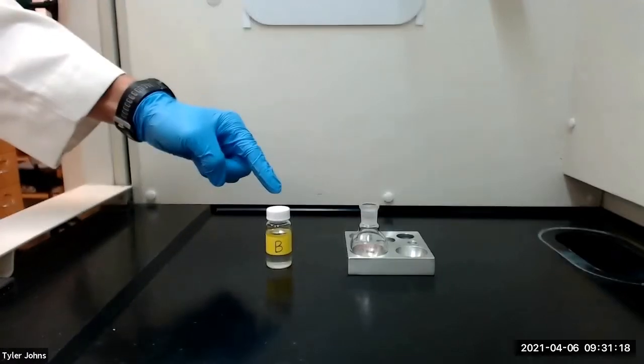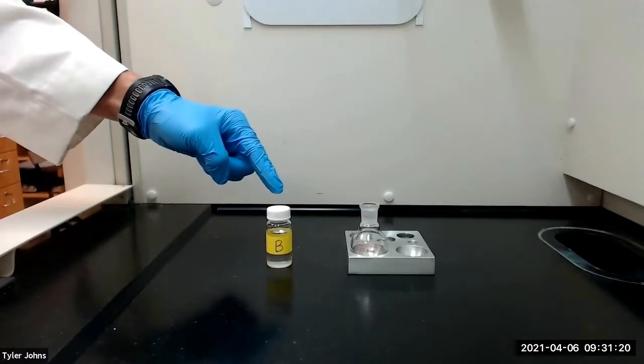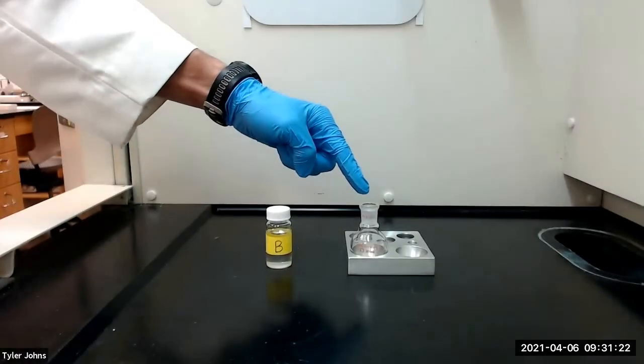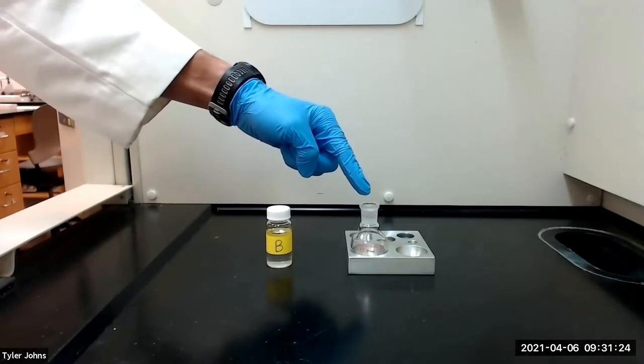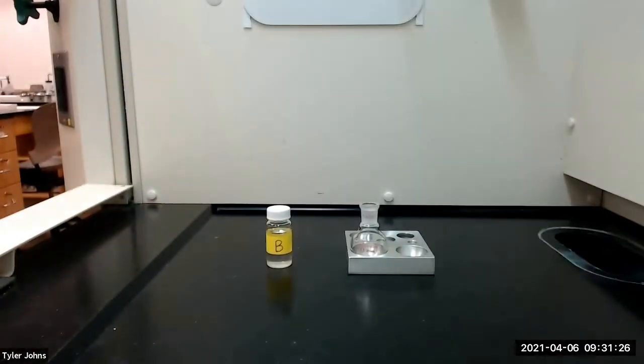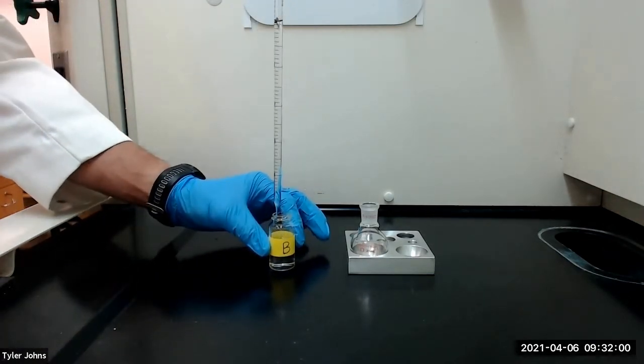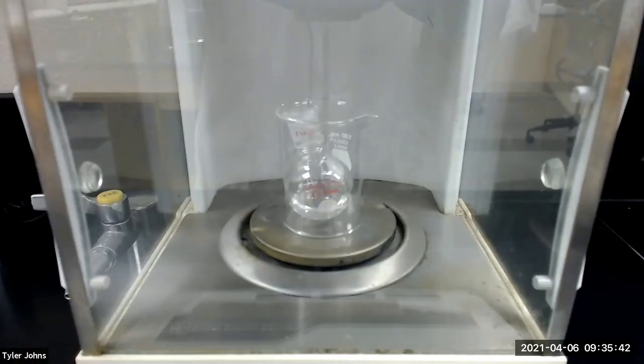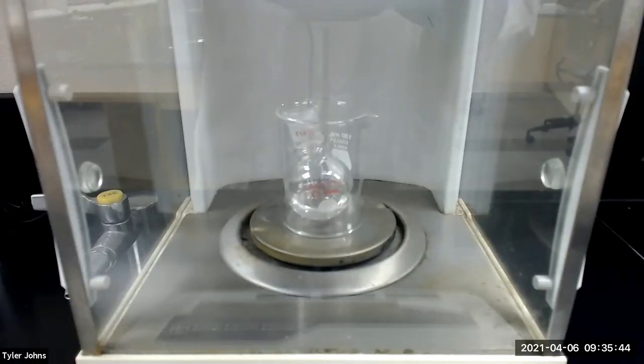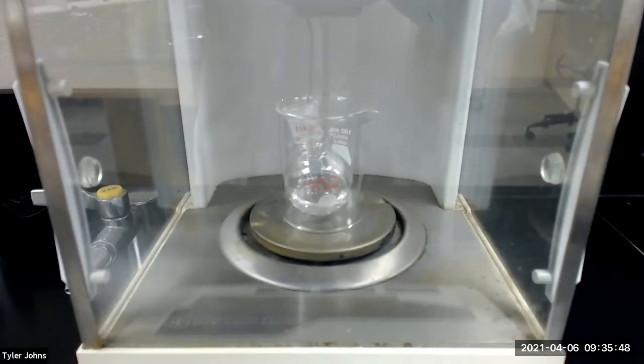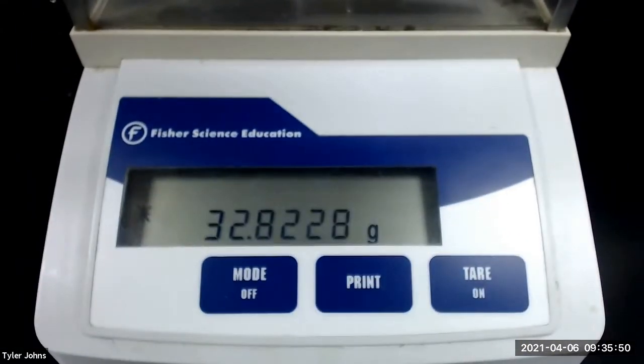We will next add 5 milliliters of unknown alcohol B to the pre-weighed 25-milliliter round bottom flask and then determine the mass of the flask plus the unknown alcohol. The mass of the pre-weighed 25-milliliter round bottom flask plus unknown alcohol B is 32.8228 grams.